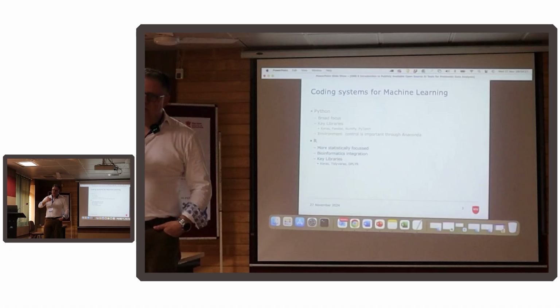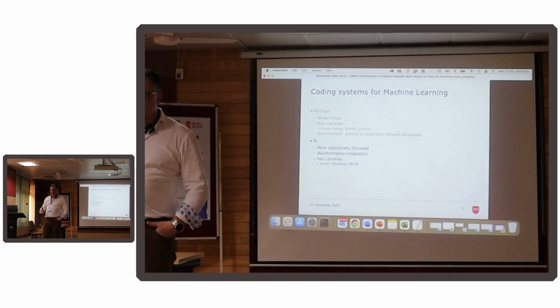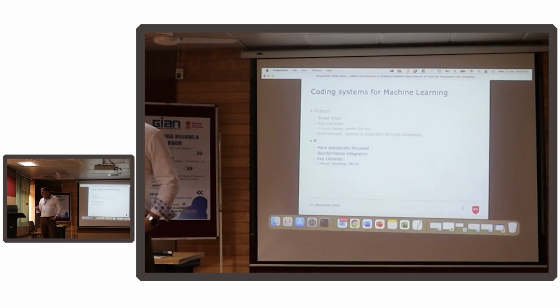So the way these things work, just to explain, you've got these libraries. You have to install and then load the libraries. And that gives you functionality that you can put into the code. So in order to do something, you load a library. And Keras is a machine learning library, so it allows you to write code that implements machine learning. There's also Tidyverse.